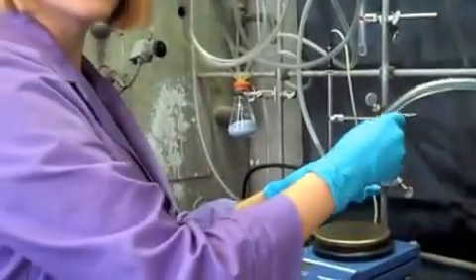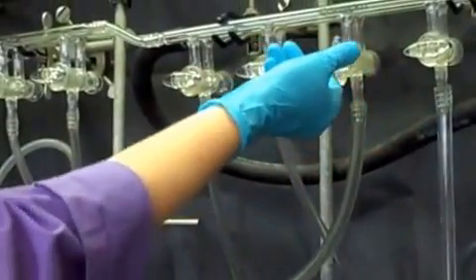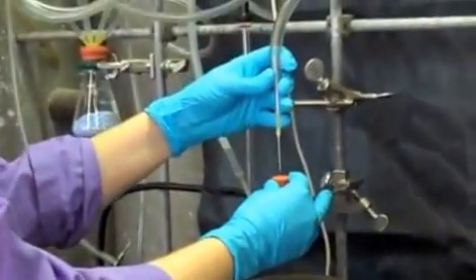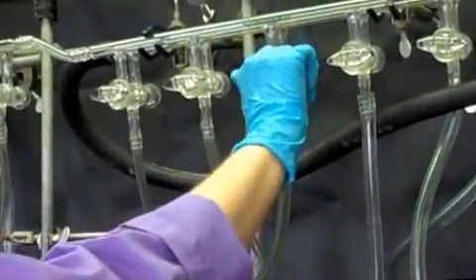I can affix a needle to a cut-off 1 milliliter syringe that's attached to the manifold. If I turn the blue dot up, this is flowing nitrogen through, and if I turn the blue dot down, you'll hear the vacuum pump starting to work a little bit harder because it's sucking just air in at this point. I'm just going to turn it to neutral for a second. We can place this needle, pierce the septum in the center, and we can pull vacuum on our vial.